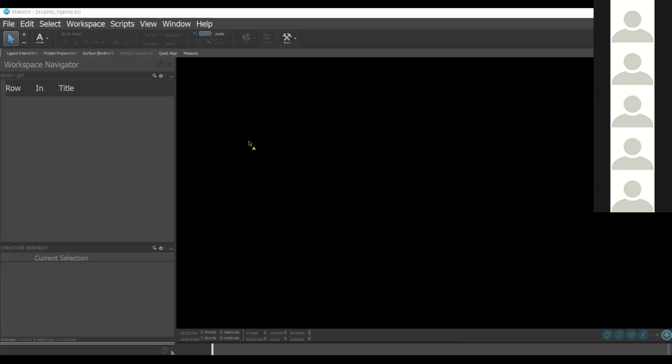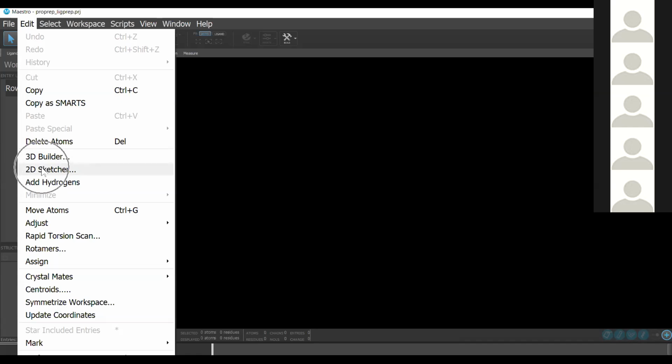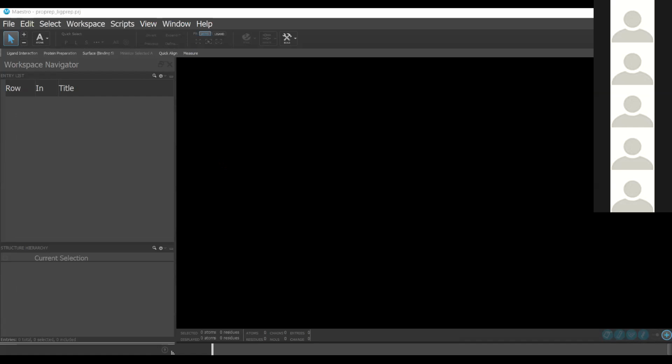The next thing that I would like to show you is what Prajwal showed you yesterday, but in a much faster way. I'm just going to repeat the same steps that he did yesterday, but because it's a recap of the session from yesterday for the first 5 minutes, I will do it pretty fast. So we are going to build a molecule. Yesterday, he showed you how to build the paracetamol molecule. So we'll go to Edit, and you click on Edit, and you go to 2D Sketcher, and you click on 2D Sketcher. So you have a panel that opens here. And we are going to draw a molecule, paracetamol.